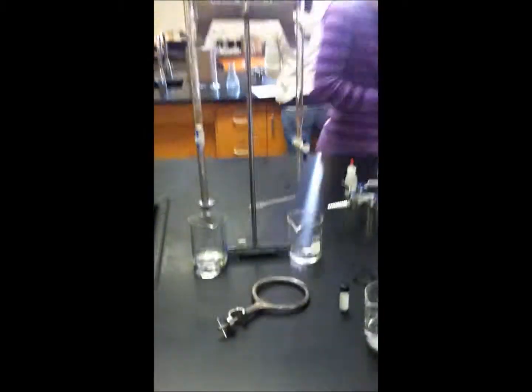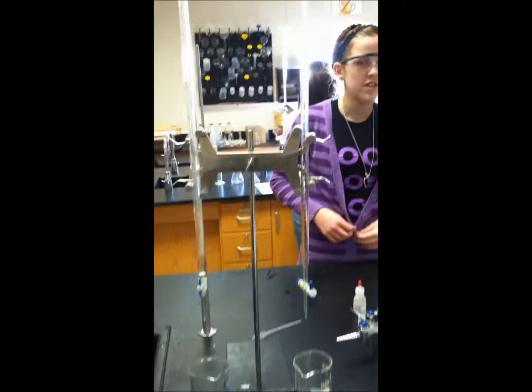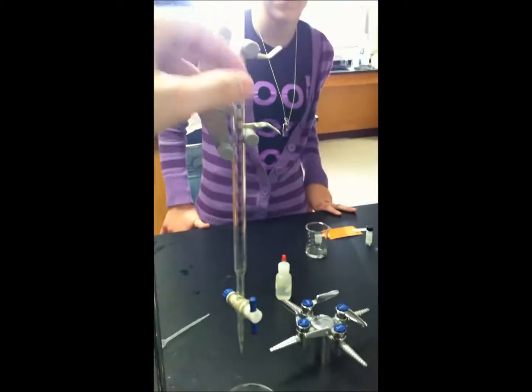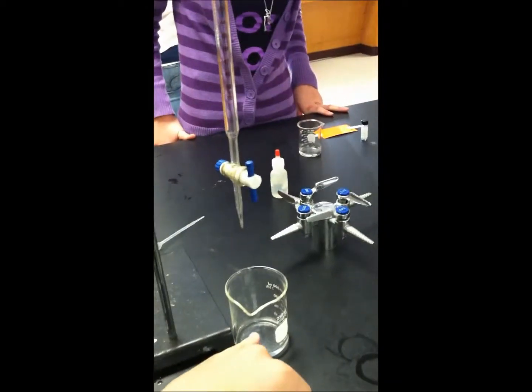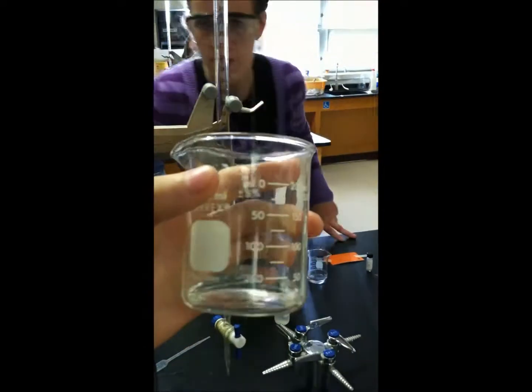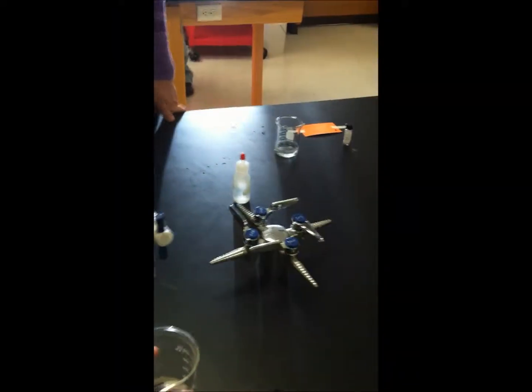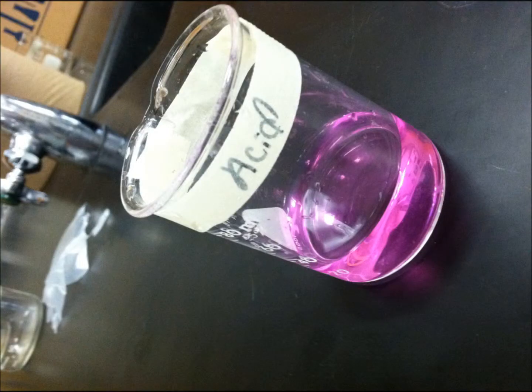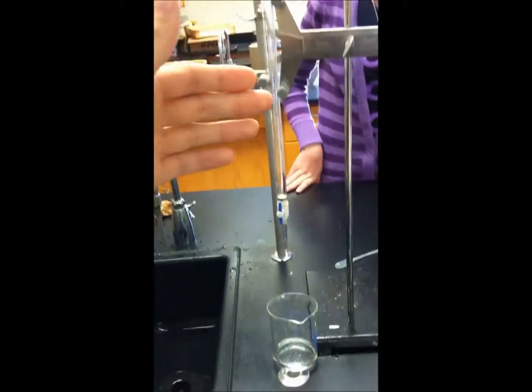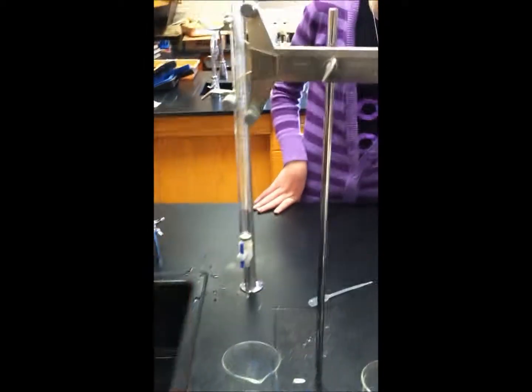So what we did before we started titrating is we cleaned these out to make sure there's no more chemicals. We have 2 burettes right here. One is going to be for the base. It's going to titrate, and we're going to measure out how much is added. So we'll know the molarity of what's going in, we'll know how much goes in, and then we'll know the volume of the acid that we have, and that's how we'll do the math, because it'll turn pink because of the indicator that's in there. We'll know when it reaches that 7 pH equilibrium. And then we'll cross multiply and use proportions and algebra to find out the molarity of the acid. On this burette right here, we're just using to measure out 10 milliliters of the acid accurately. So that's step number 4.